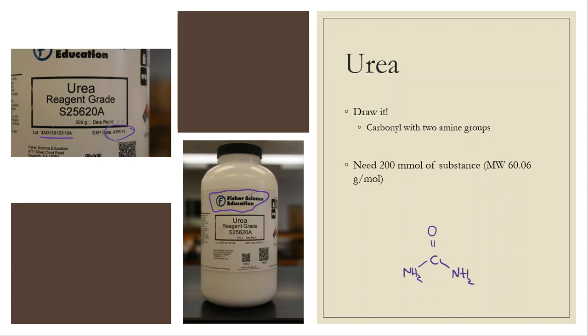However, we still use these crystals. Again, we use expired chemicals all the time. It doesn't mean that they're bad, but if I was working in a regular, regulated laboratory, we would be dumping this and we would not be using it past the expiration date. General chemicals, though, they normally have very, very long shelf lives.